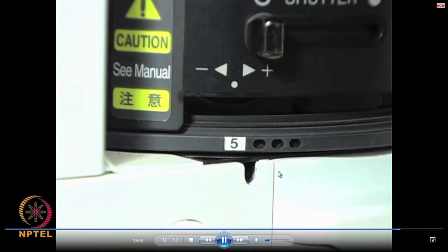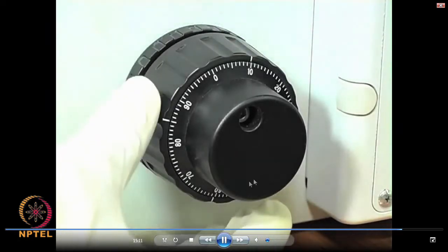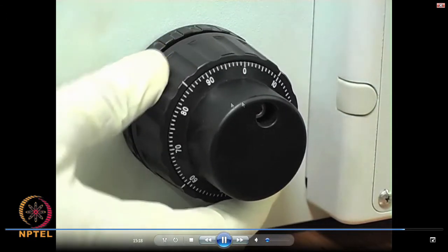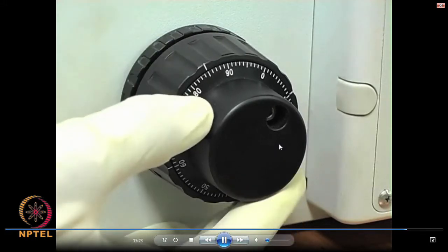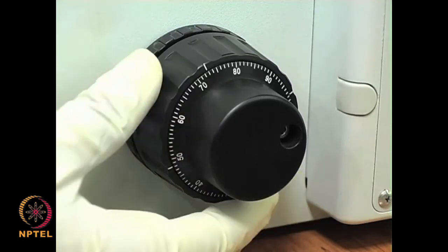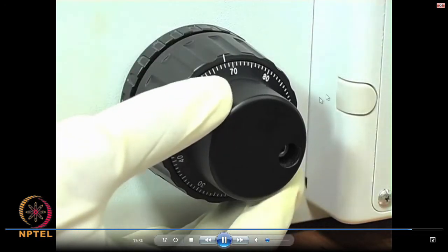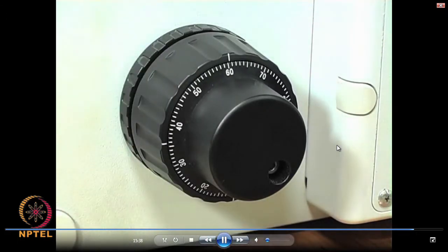So the next detail we would like to see is the focusing knob. The bigger one is the coarse focus, and the smaller one is the fine focus. It will basically move the stage towards the objective or away, and you will start focusing the specimen. This is coarse, this is fine. The smaller one is fine.